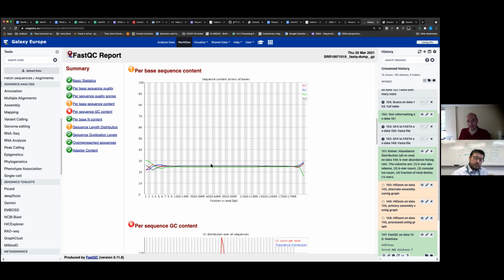But you can see that, as expected, all bases, T, C, A, G, when you walk through the read, are all present at about the same proportion, especially when you start to average, as in this case, between 500. I find it interesting that at the end you lose some randomness a little bit at each extremity. That's interesting. Right. Well, I suspect here there is something about the adapter or similar, maybe something completely clipped. Yeah.